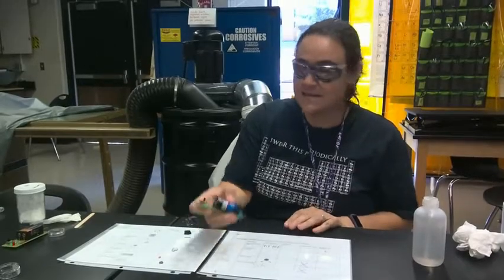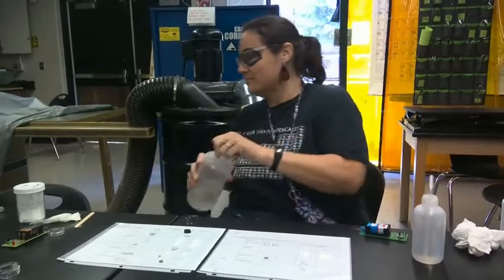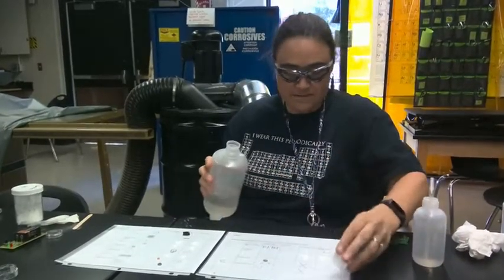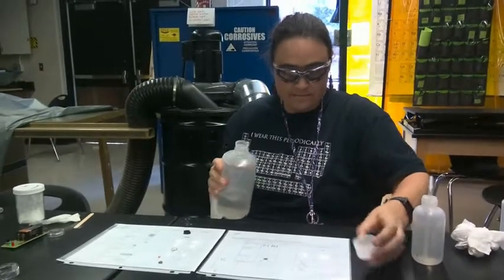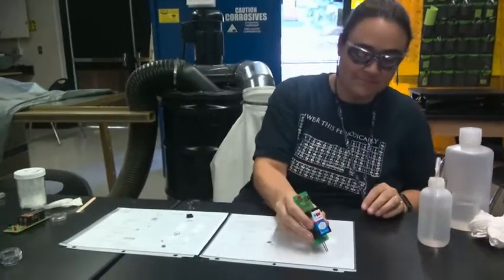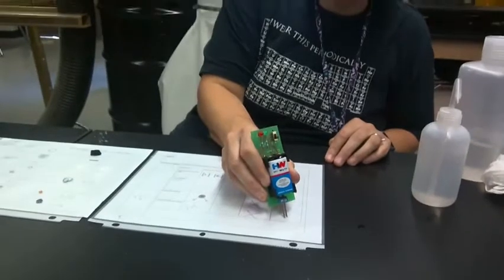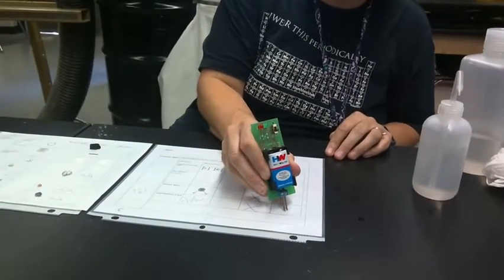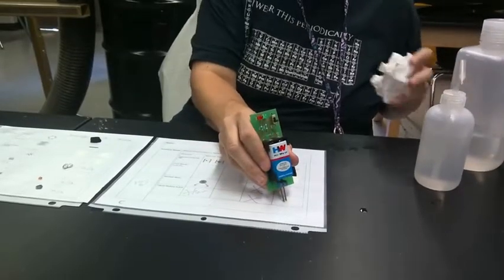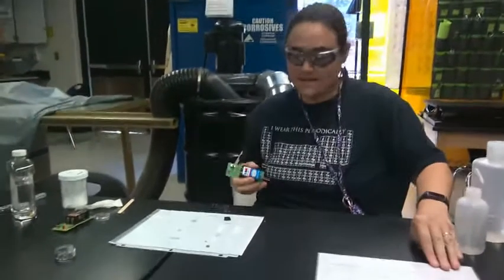Then lastly down here we have some ethanol. Just a couple drops. And you can record your result there. Okay. All right, moving on to the next page.